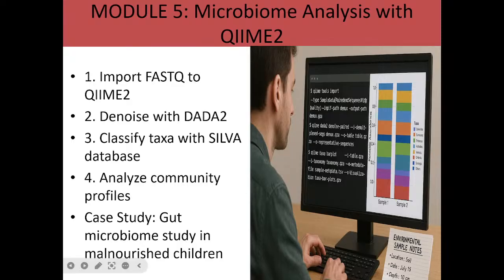If you look at that guy, he has only two samples, and from whatever note he is taking, he took note of the location, that is, in the soil, the date he collected it, including the depth at which he collected his sample. He recorded it. So he took sample one, you can take sample one here, and you can take sample one in any other places.